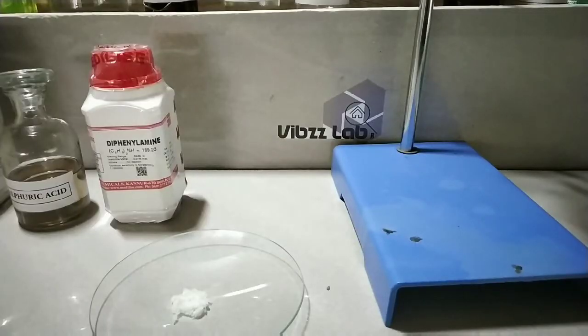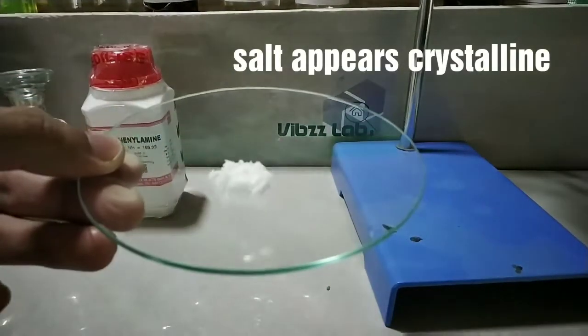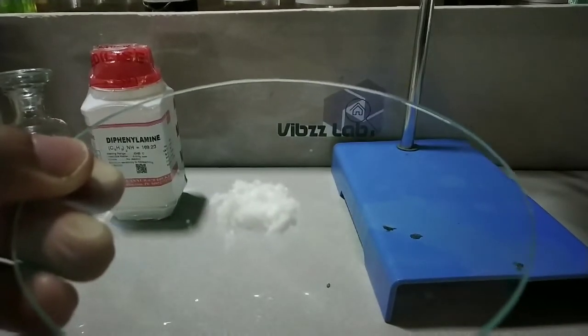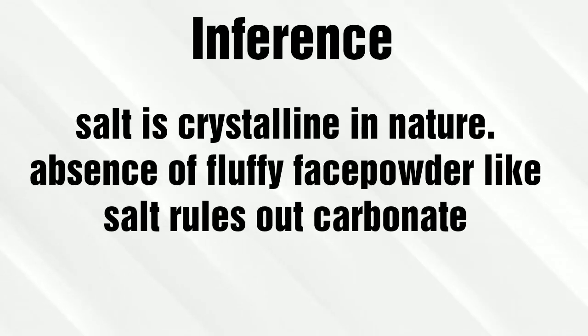All qualitative analysis for anions begins by inspecting the solid salt. Here you can see the salt appears colorless, otherwise white, crystalline in nature. Inference: the salt is crystalline, hence we rule out carbonates.